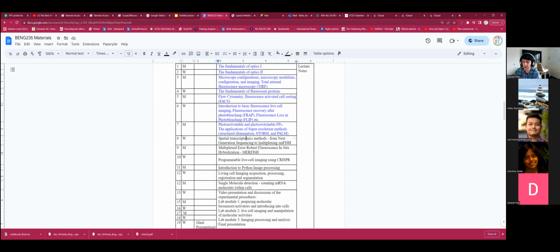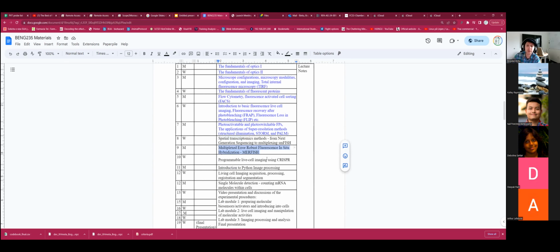So I'll be describing what spatial transcriptomics means, which is one of these famous new modalities of how to effectively do many, many, many colors in a single fixed sample. I'm going to go in a little bit more depth on one particular one that I specialize in, and I'm going to explain how this ties to CRISPR.